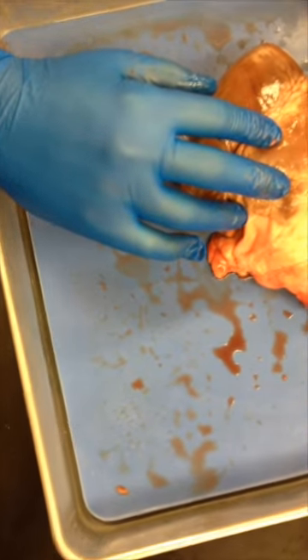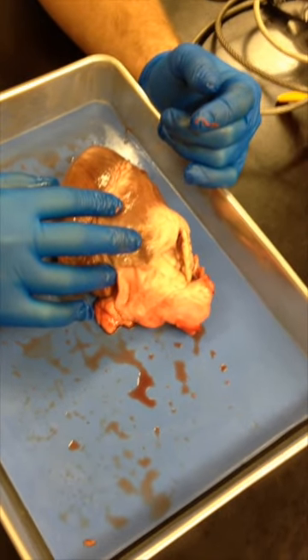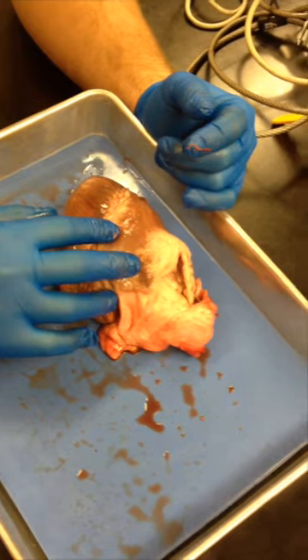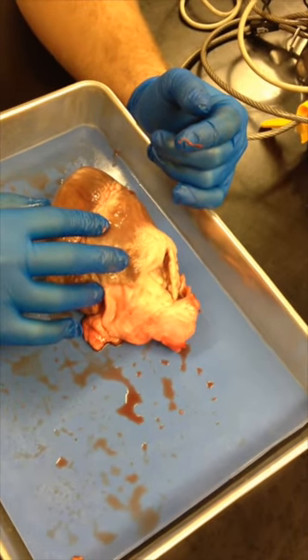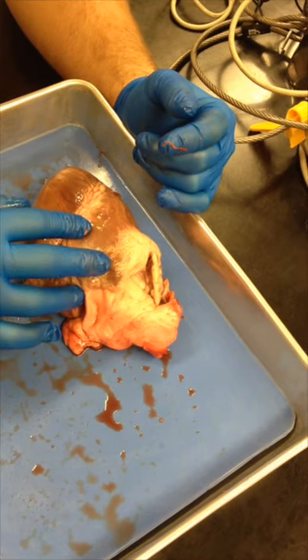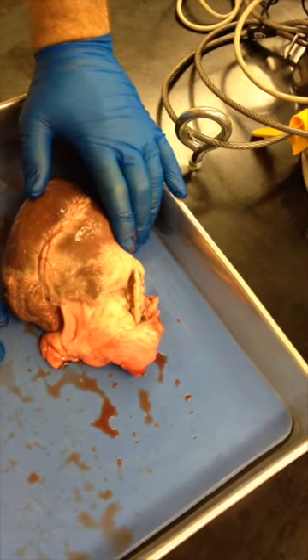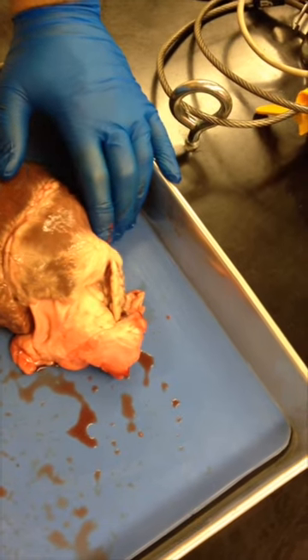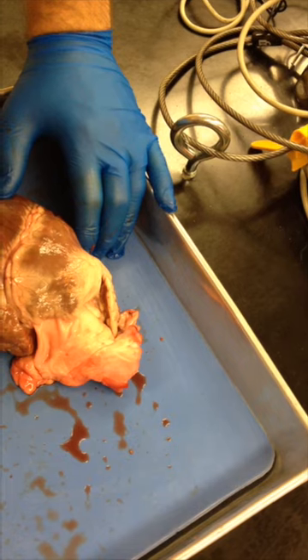Where's your lab, Daniel? Oh, in the binder. Ductus arteriosum. Is it near the bottom or the top of that? You remember? It's the bottom. That's unfortunate. Ligamentum arteriosum? These are some really big questions.